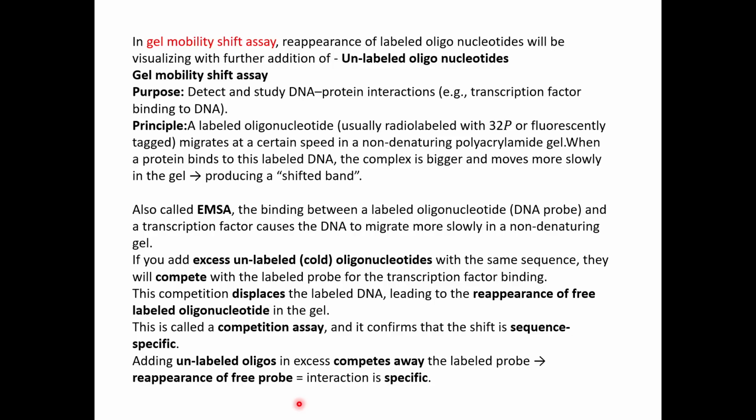So the next is unlabeled oligonucleotides in case of gel mobility shift assay.